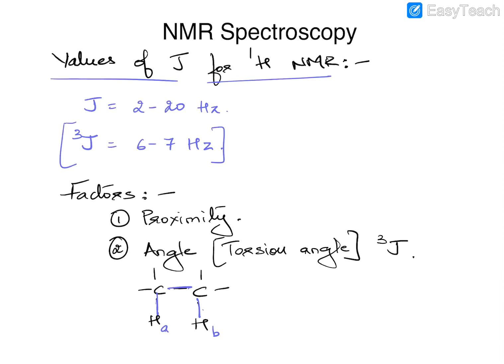So in some cases where there is free rotation possible, you don't see the effect of torsion angles, but in some cases where rotation is restricted, then you would see some typical effect of the angles.